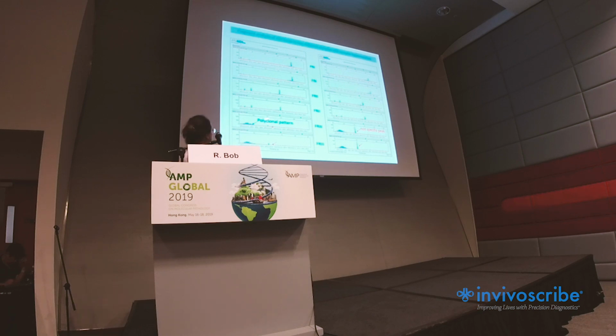That's the reason. Quite frequently with clonal B cell populations, what you see here is confirmed with fragment analysis of framework 1 and 2. We have a polyclonal pattern for framework 3 because of somatic hypermutation, and it's quite frequent. This is a non-specific peak of 200 base pair length, which is here smaller, here larger, but comes frequently, and you will see always the same size in all of your samples, so it's known and you won't make a wrong decision when you have this peak.